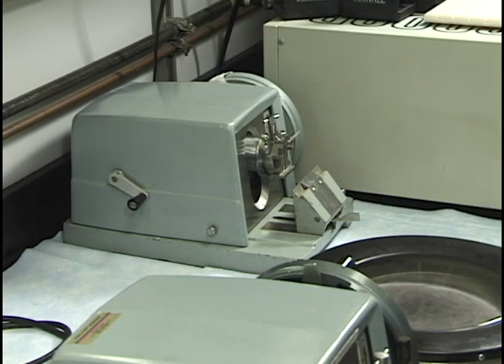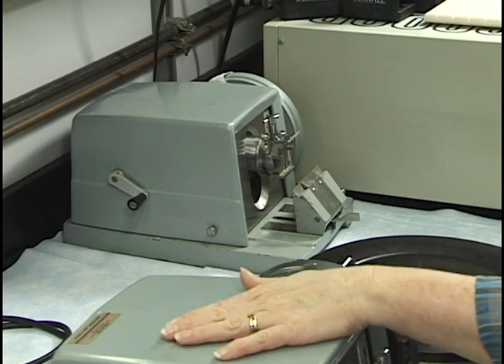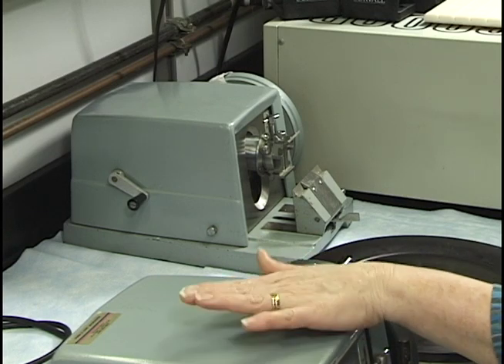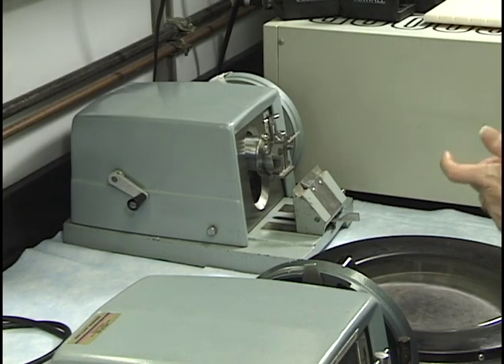Alright, I wanted to show you our broken microtome. This microtome has quite a few issues, but it's a nice one just to get a feel for fooling with things and not having to use our one that's set up nicely and pretty close to established parameters. So this is a nice one. If you just want to get a feel for what I'm talking about, you can just play with this one since it is broken.